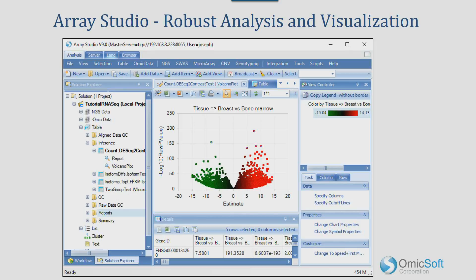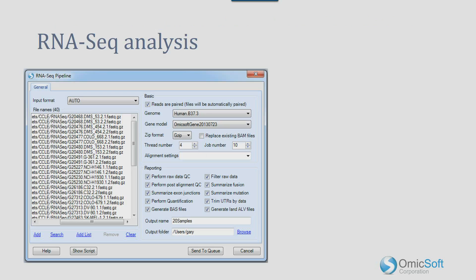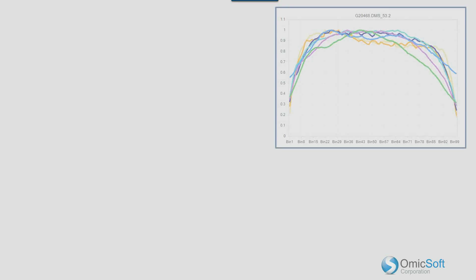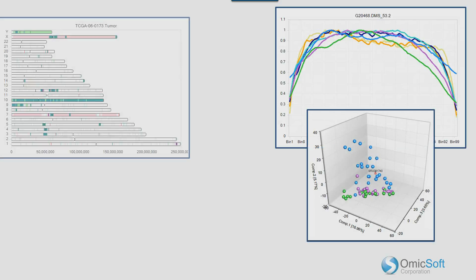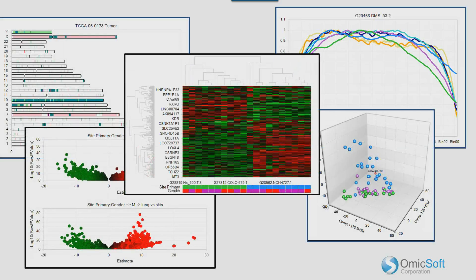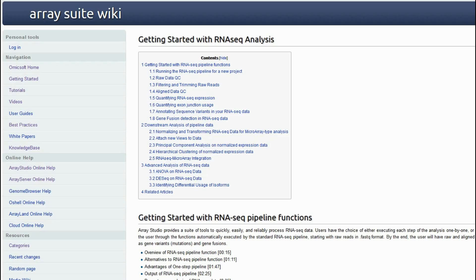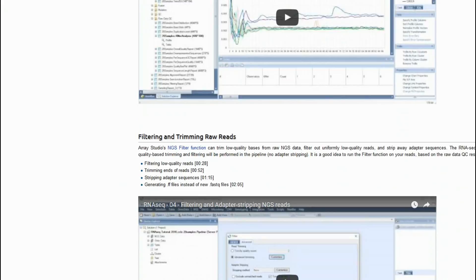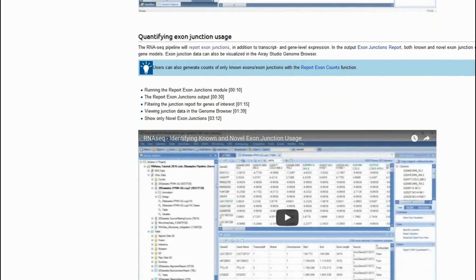Array Studio contains a powerful suite of tools for analyzing and visualizing microarray and NGS data. The point-and-click interface launches bioinformatics functions to process and analyze your data, and output results are loaded back into your project, where you can generate rich visualizations to explore your results. Detailed workflows can be found in our video series page, including DNAseq, RNAseq, copy number, RT-PCR, and expression microarray analysis.